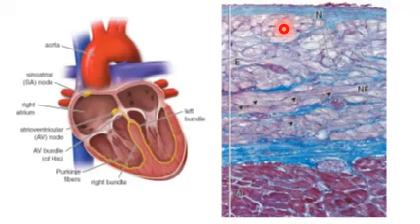Those are the nuclei of the Purkinje fibers. Of course, this is the endothelial cells, and this is the dense connective tissue layer. Within the dense connective tissue layer, we can observe the smooth muscle cells, and this is lightly stained. This lightly stained segment is the subendocardial layer, which contains those pale stained cells.